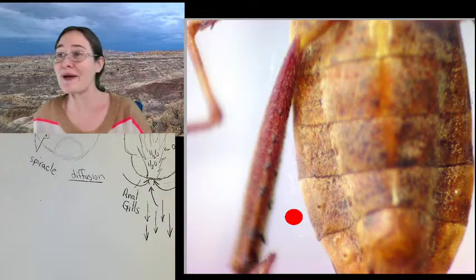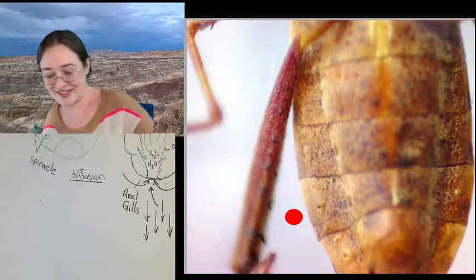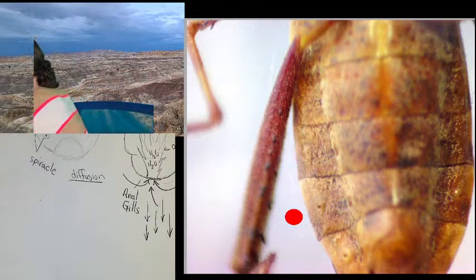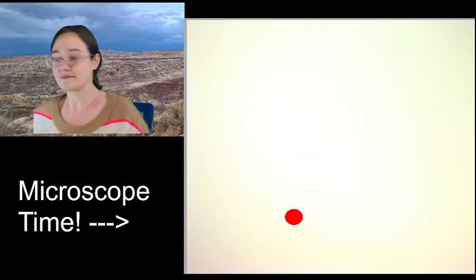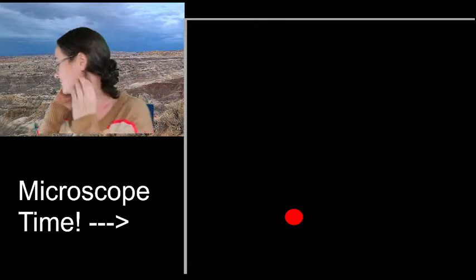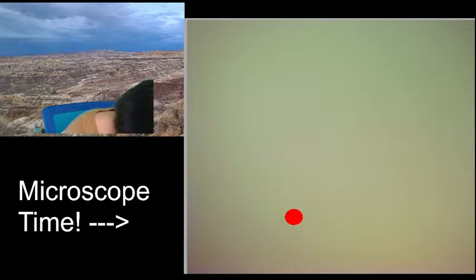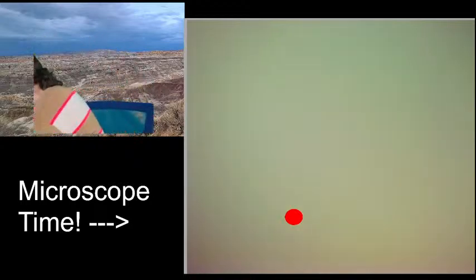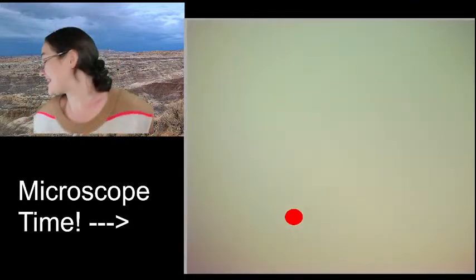You know, what's cool about having everything right here is I have the ability to just kind of pull things as we want to see them. So, looking for a pair of forceps. My forceps are MIA. Finger time. Okay. So, this is a baby damselfly.